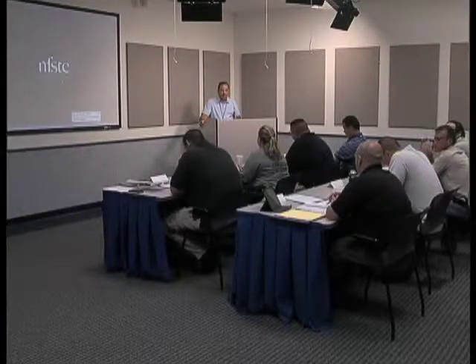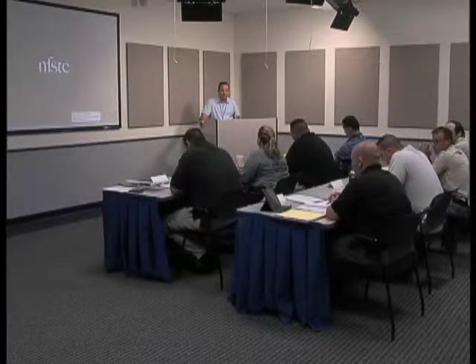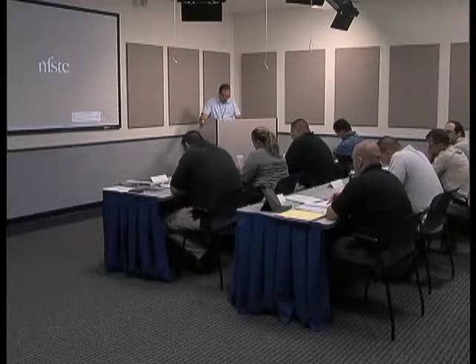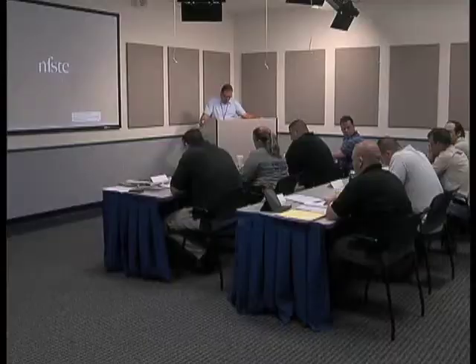Who would like to go next? Adam? Okay. Well, we began by blanking each of our sample cards just to make sure they were cleaned out and clear before we start anything else. Then we established a control blank by putting it into the empty can for 15 minutes, and allowed that one to start cooking. And then we added 10 microliters of the liquid sample.